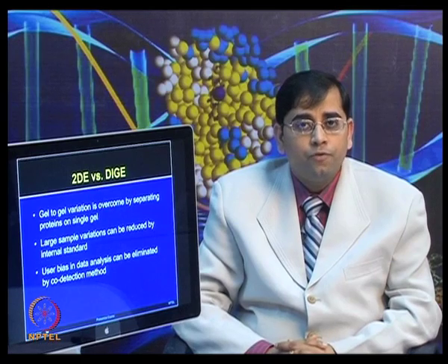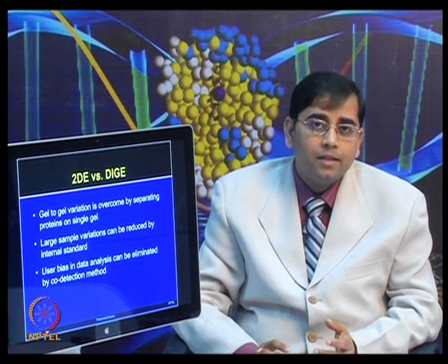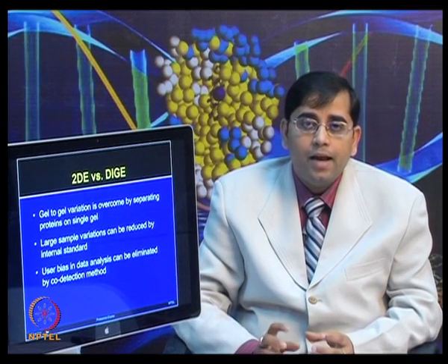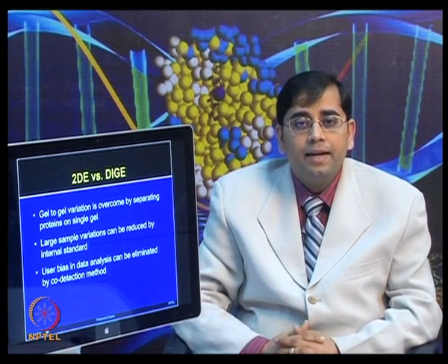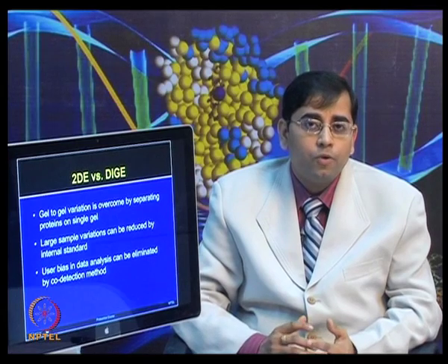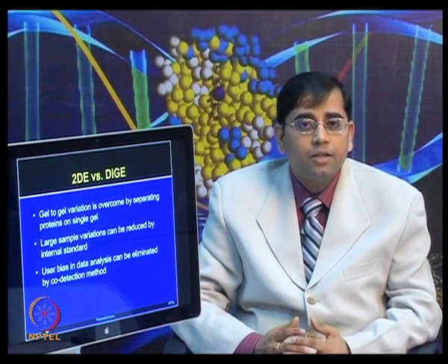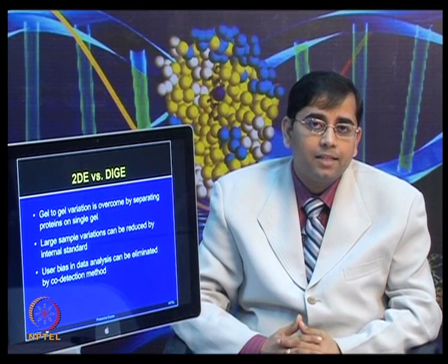Now, in two-dimensional electrophoresis, often in the data analysis there is user bias in how to define the spot boundaries and obtain the statistical information, whereas in DIGE there is a co-detection method involved in the software analysis, which eliminates a lot of user bias in performing this analysis.